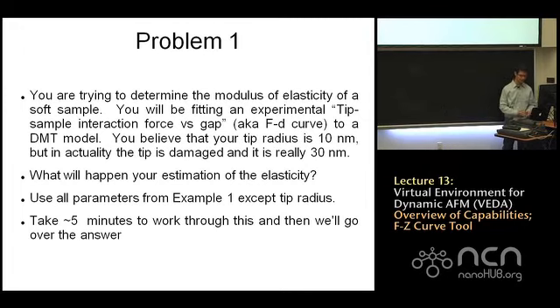Okay, so in this first problem, let's say you're trying to determine the elastic modulus of a soft sample. And the way we'll do this, which I think you probably covered on Tuesday, is to fit the curve to a model. So you do some sort of nonlinear fit, and you'll get a parameter, assuming a model, from a measured force distance curve.